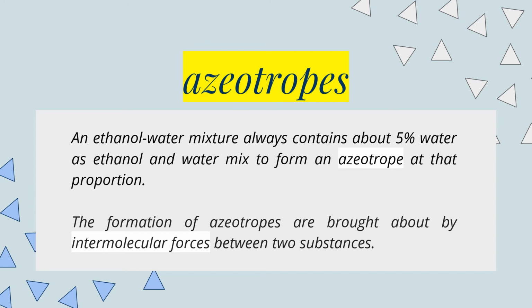Azeotropes are specific mixtures of compounds in which the vapor formed in distillation has the same composition as the unboiled solution. Because of this property, simple distillation is no longer readily able to separate the components. As each azeotrope has a specific boiling point, azeotropes are classified depending on their deviation from the ideal phase diagram. Azeotropes in phase diagrams that deviate positively from the ideal diagram and reach a minimum have a lower boiling point than either of its components.